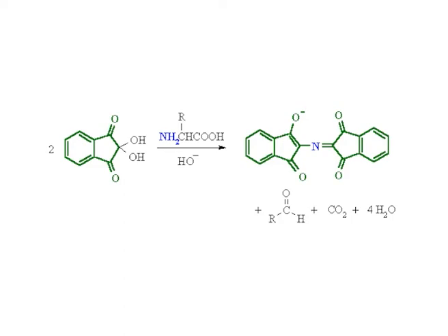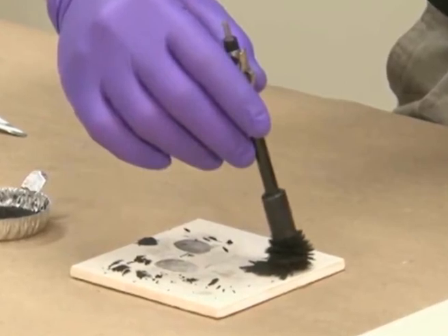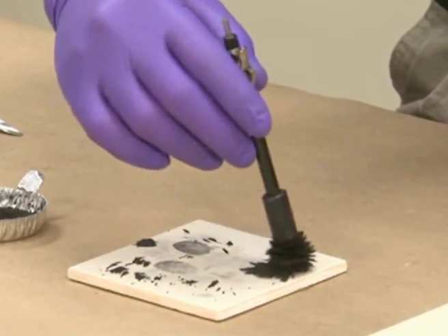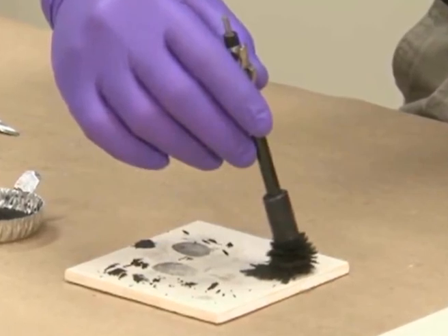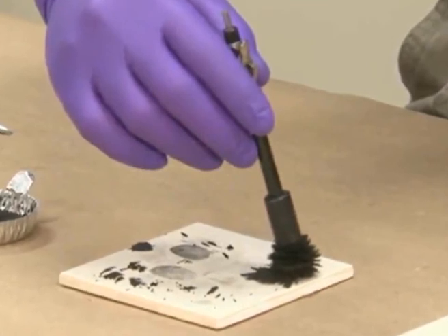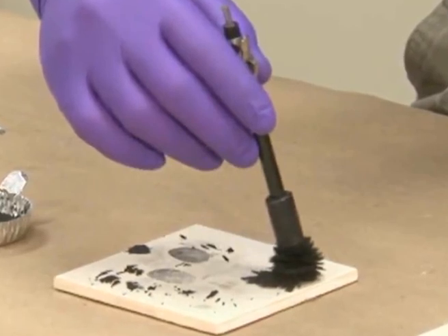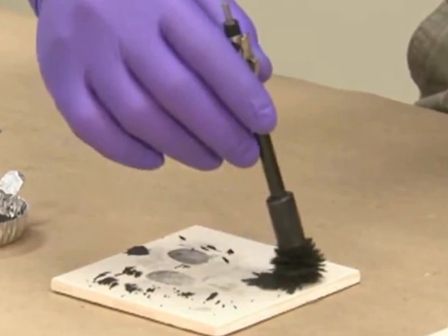The other amino acid specific reagents are advantageous in that these produce fluorescent derivatives on reacting with the amino acid content of sweat residue in one step. Two of these reagents, that is 1,2-indanedione and 1,8-diazafluoren-9-one, have been validated for detecting latent fingerprints on porous surfaces. The detection methodologies have been standardized and these procedures are being used in casework investigations.